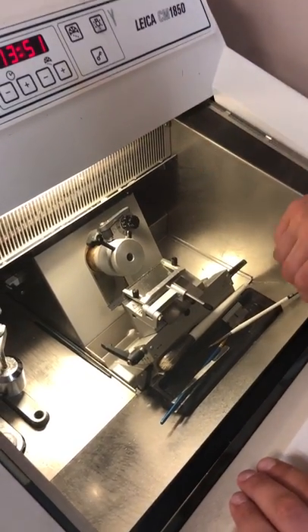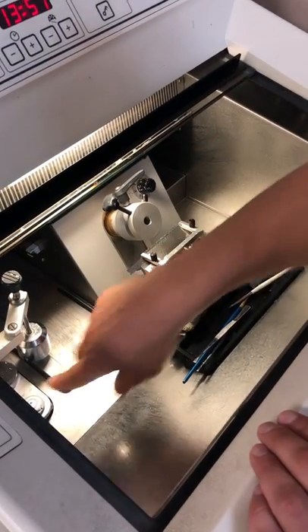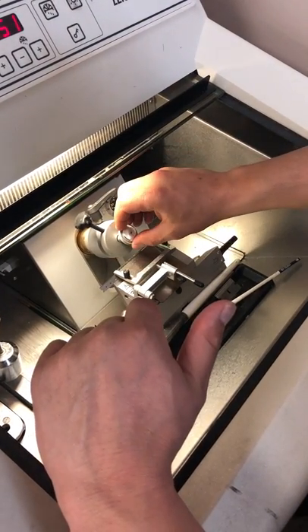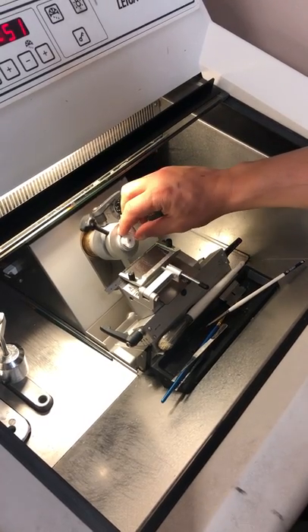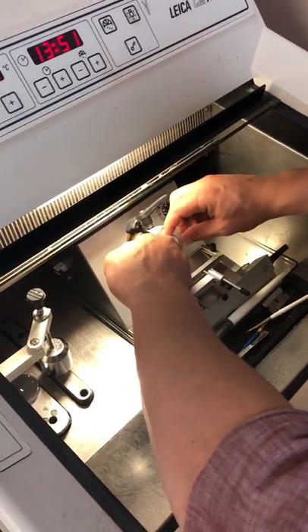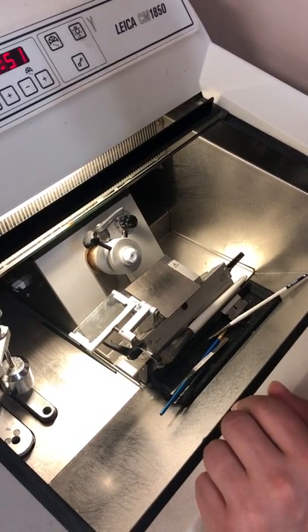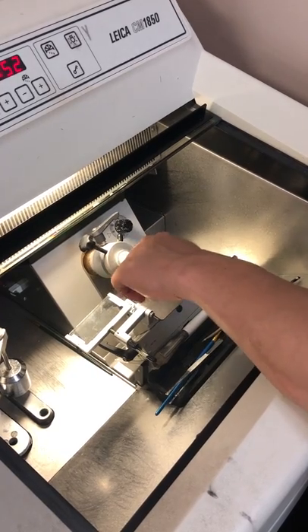First thing is we put this in 50. We already have our sample here with a lot of OCT around. We put this thing down, set it there kind of straight, and we close it tight. We check it out — this needs to be closed and set when you're managing here to avoid any cut.